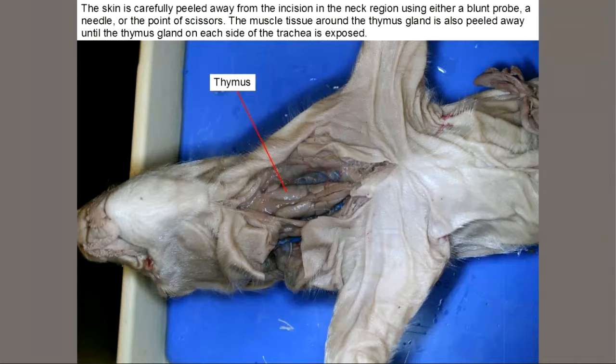Okay. So we will cut our pig. And we'll take a look on the inside. We'd start at the gash that they had started here in the neck. A little gash there. And we would be able to do a little incision and cut with the scissors and spread the skin out a bit. So we would cut this way, and that way, this way, and that way. So we could make flaps and open it up.